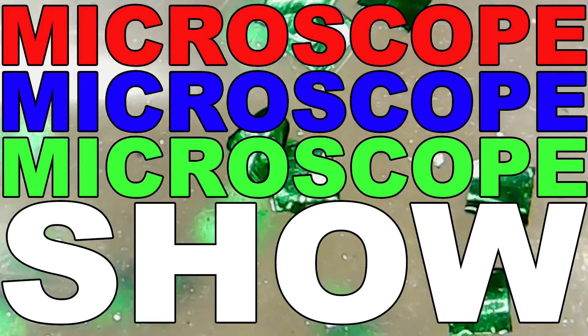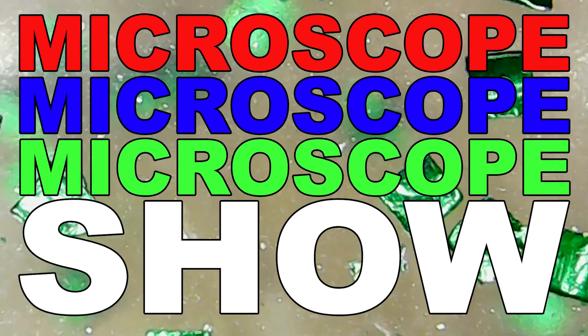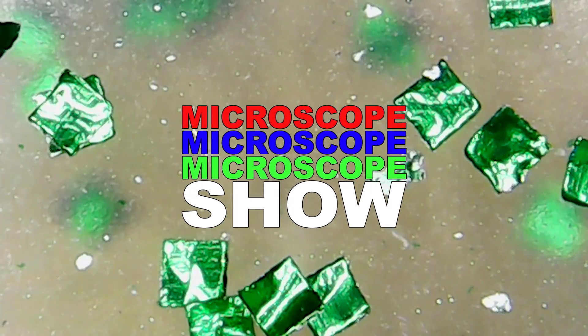Microscope, Microscope, Microscope Show.